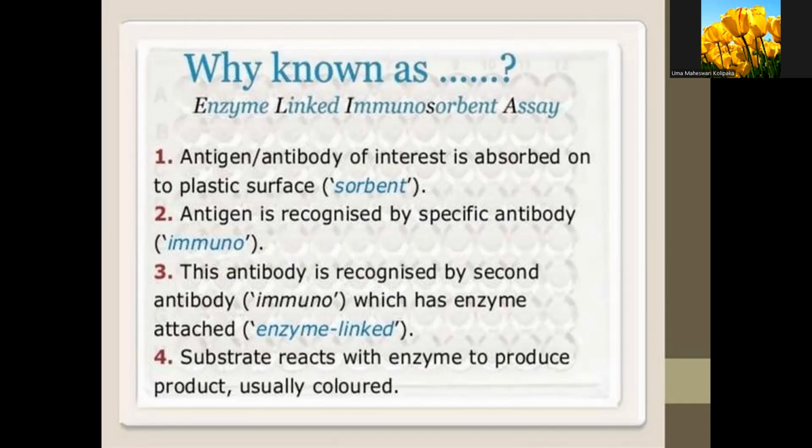How the name is given means antigen and antibody of interest is absorbed to a solid surface, that is plastic surface, which we can call as sorbent, and antigen is recognized by a specific antibody with the help of immunological reaction, immunological response. Basically, antigen will react with the antibody or antibody will react with the antigen. This is said to be immunological response.